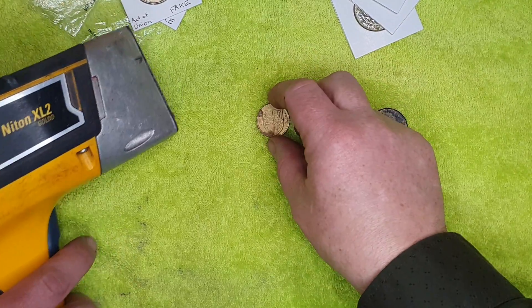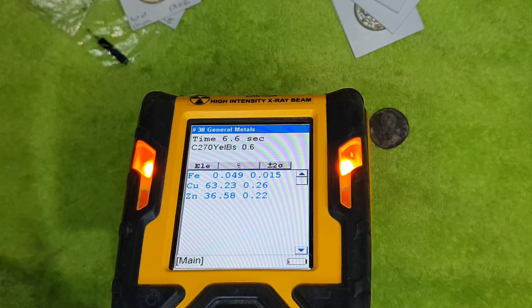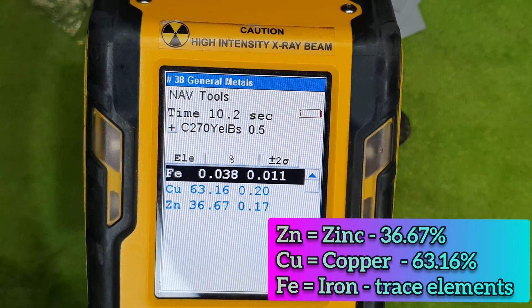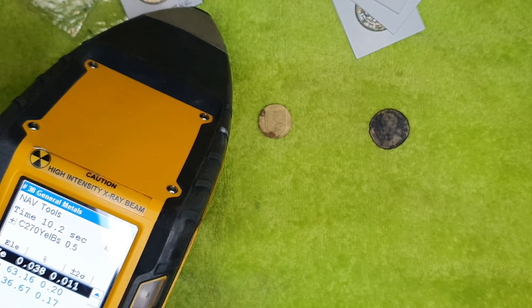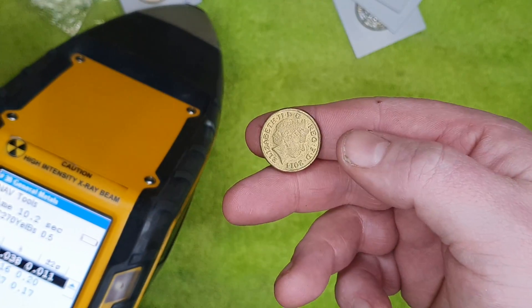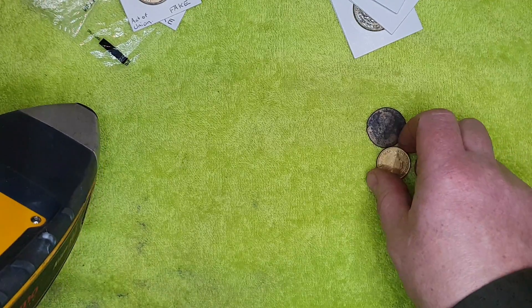We'll go for this coin next — this should be copper nickel brass. Zinc and copper make brass, don't they. That's again code C270. So that could be a genuine one. See, that's another code I've never seen — C270, yellow brass. Yellow brass: 65% copper, which is right. So that's your old brass.